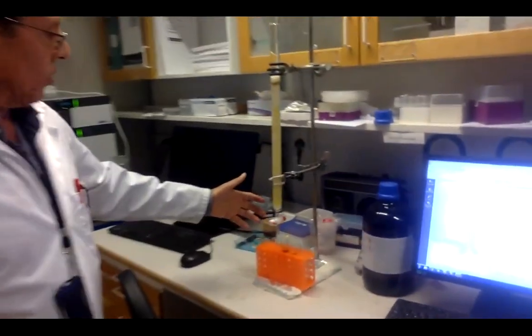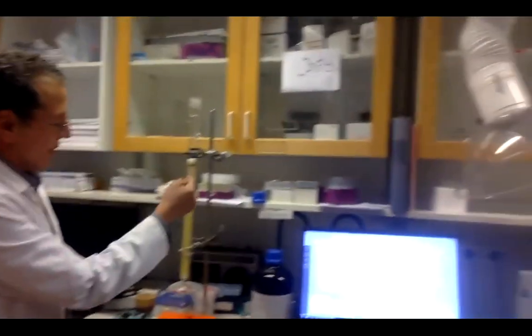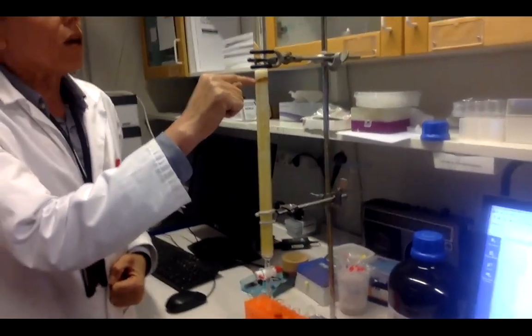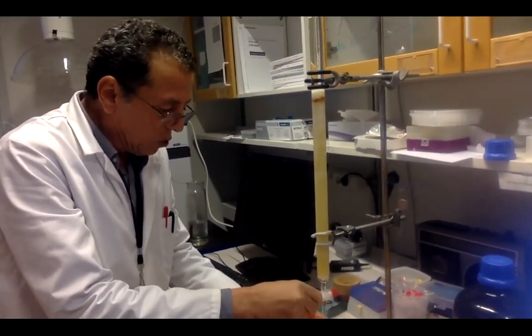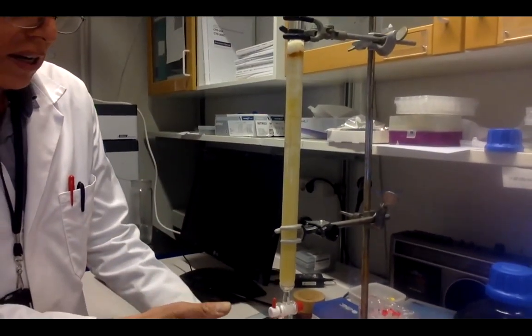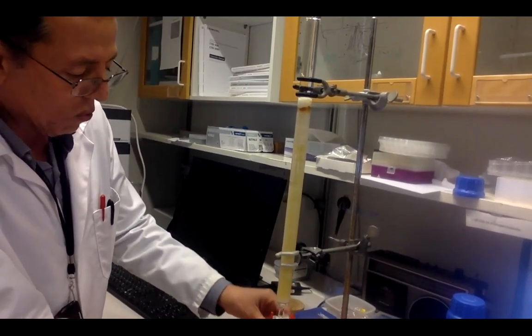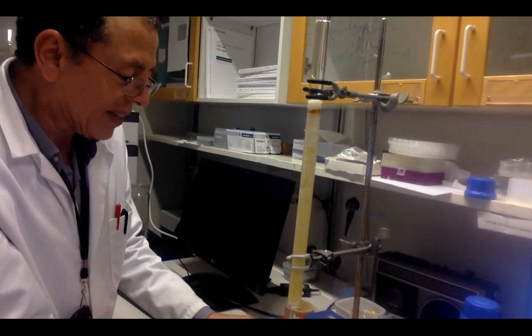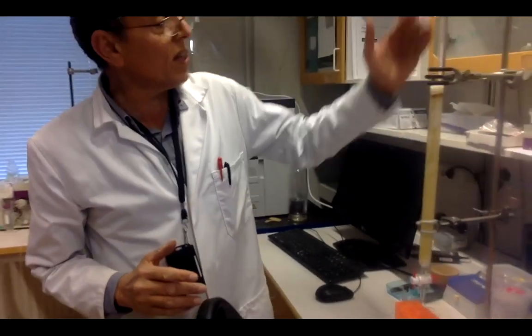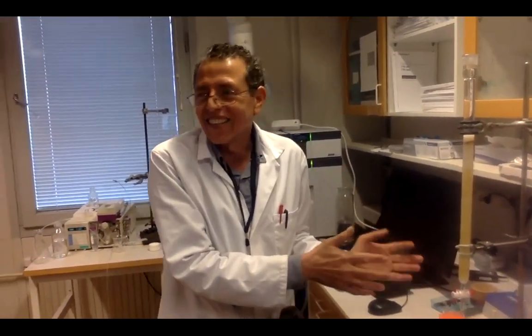We take the extract and start the isolation using column chromatography. This is easy to use and easy to observe. There is a stationary phase — the matrix we use — then you load the extract, and the mobile phase elutes compounds through the column. The elution proceeds according to increasing polarity. You can see compounds going from colorless to colored, with increasingly intense color. Compounds are separated according to their polarity.